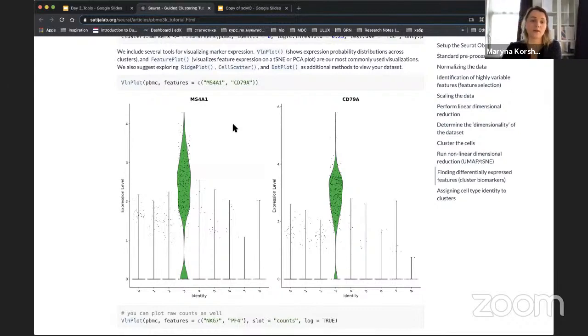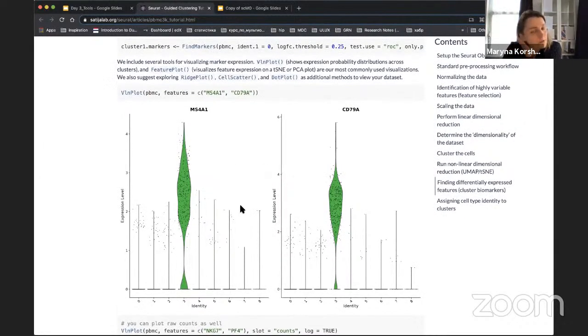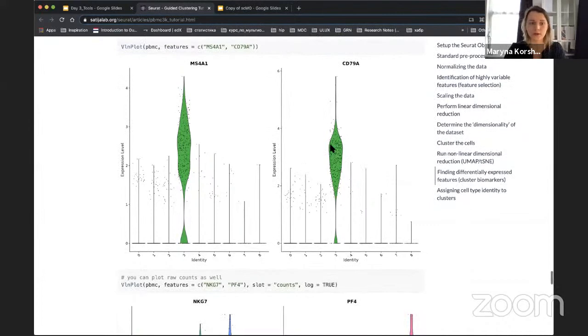For example, quite usually on your representation or your visualization, you see even the cluster of dividing cells, because they have these cell cycle genes intensively expressed. But also you might plot this TOP2A or the other cell cycle related genes, and you will have them in different cell clusters. So in brief, you use this visualization to support your hypothesis about these particular biomarkers.